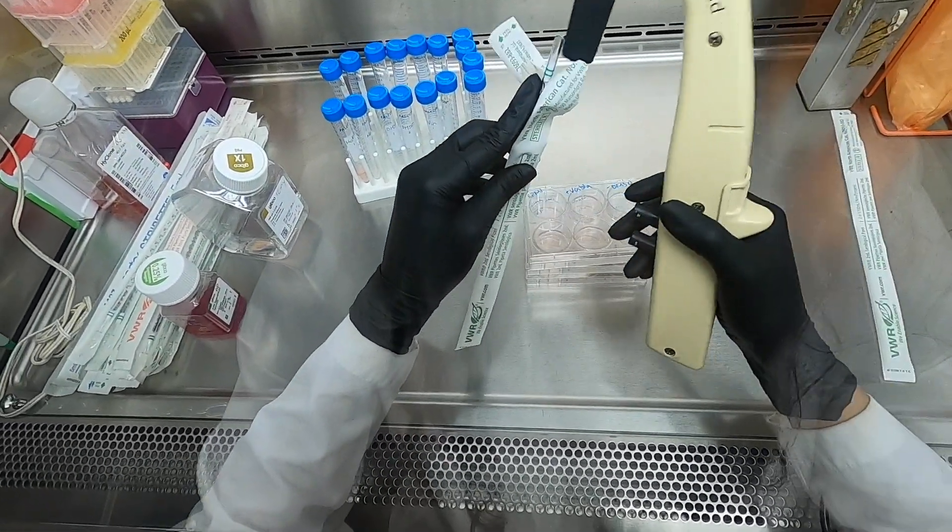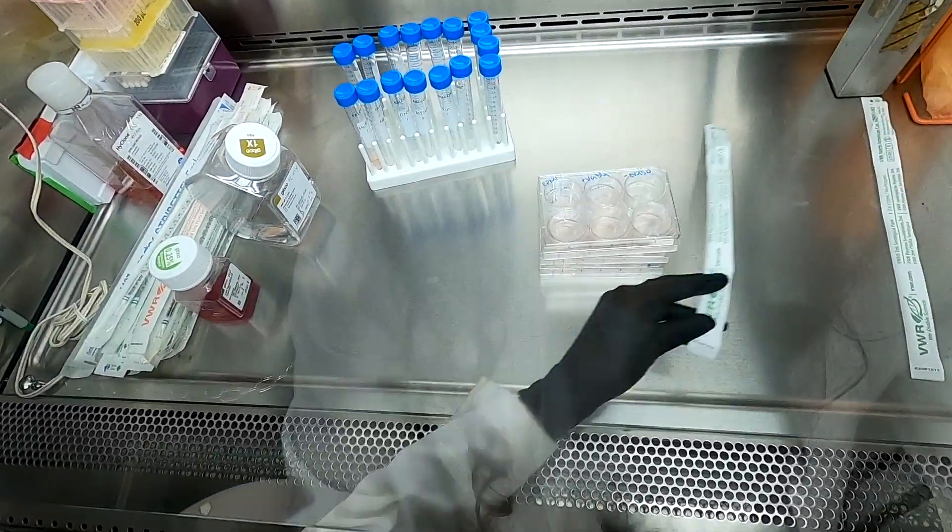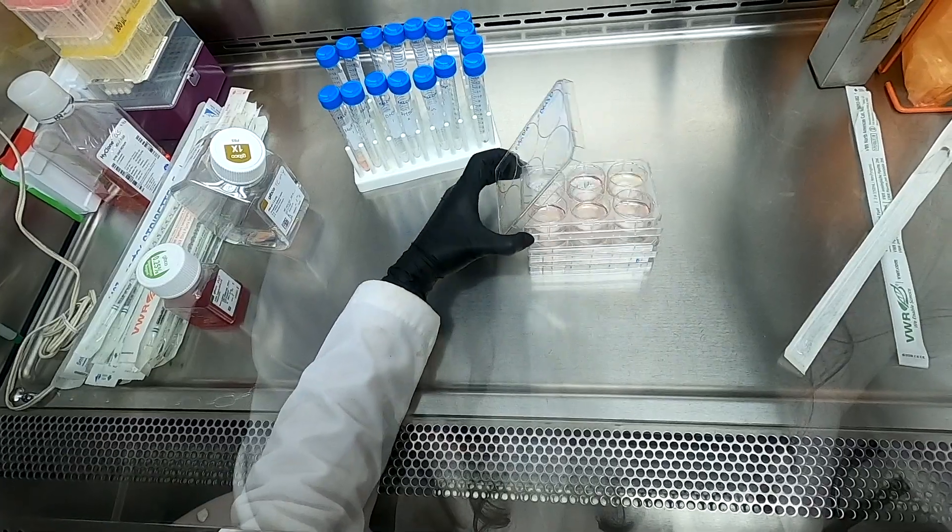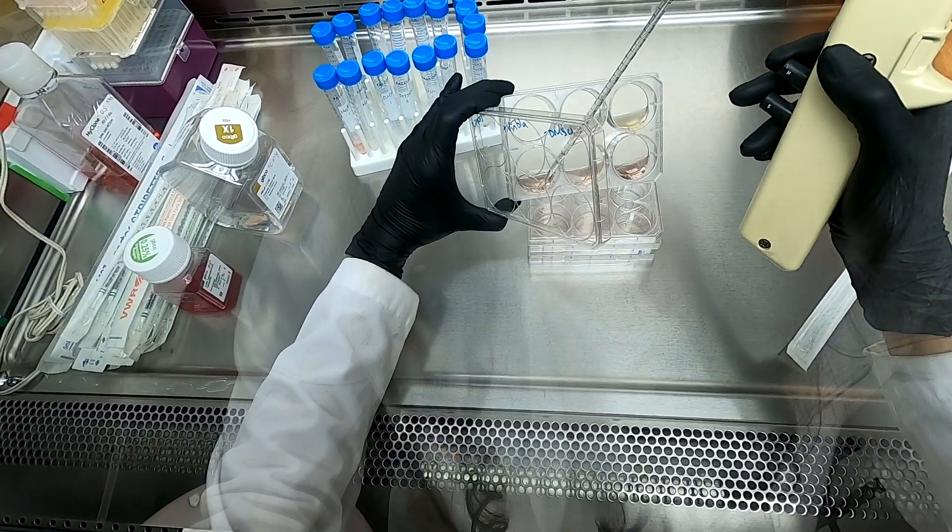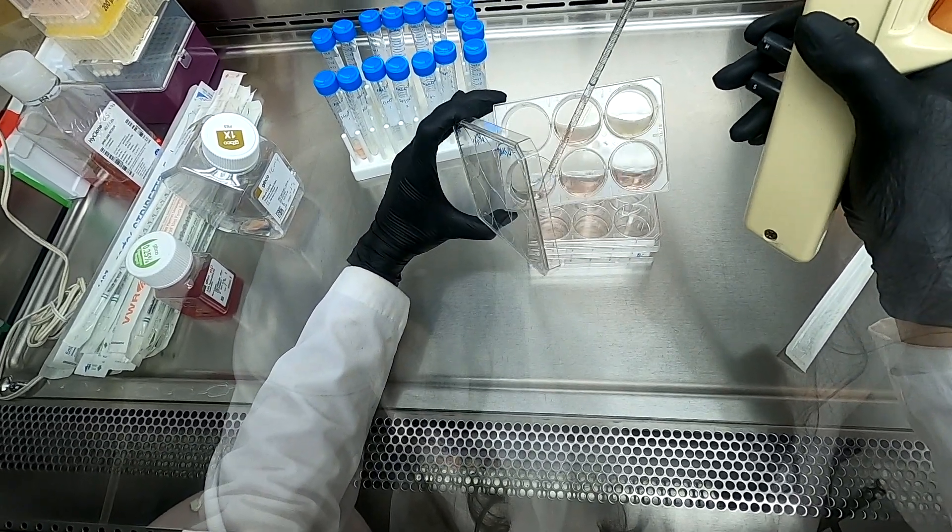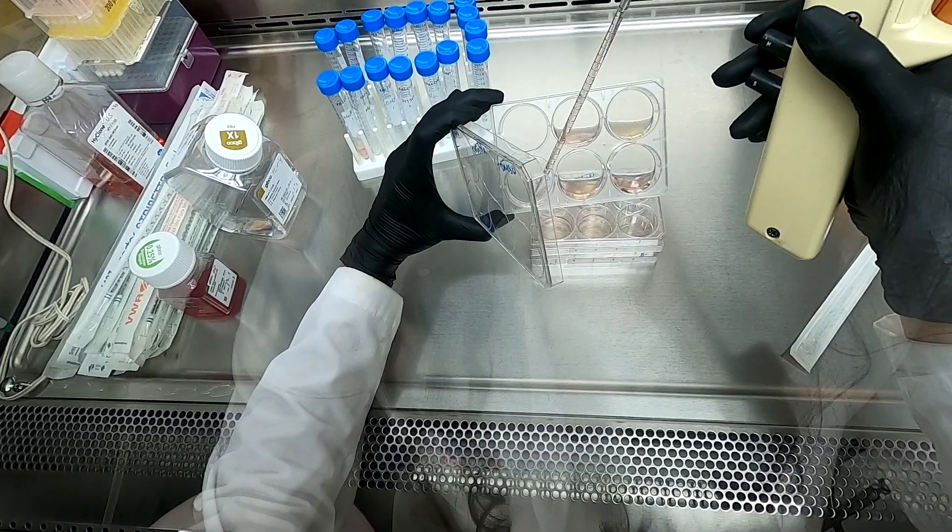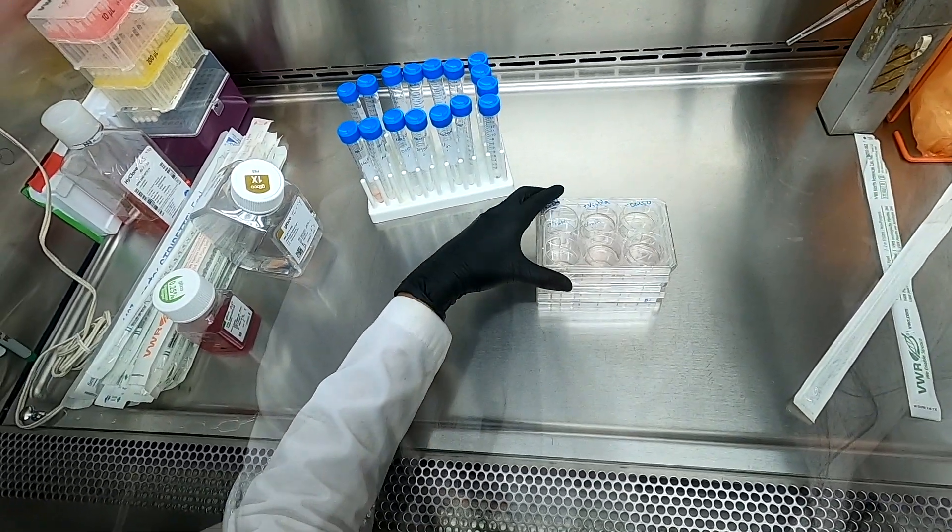First, we begin by aliquoting the supernatant from each of the wells into previously labeled 15 ml conical tubes. The reason for keeping the supernatant is to keep the floating cells, which are undergoing mitosis or may be dead after the treatment.